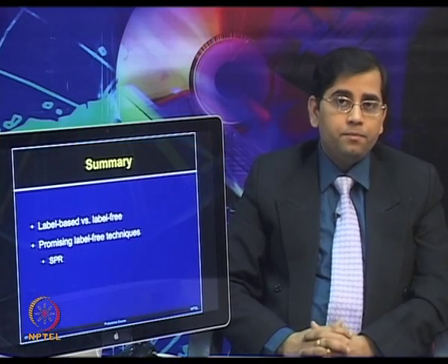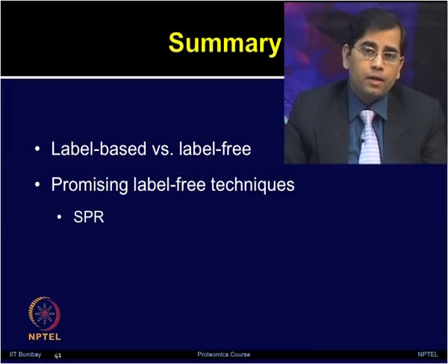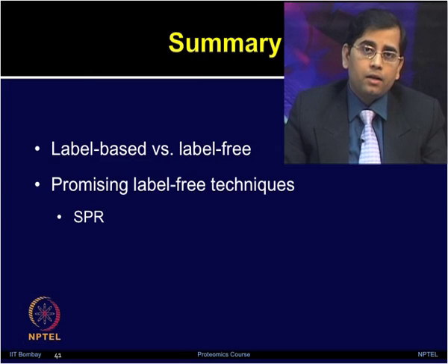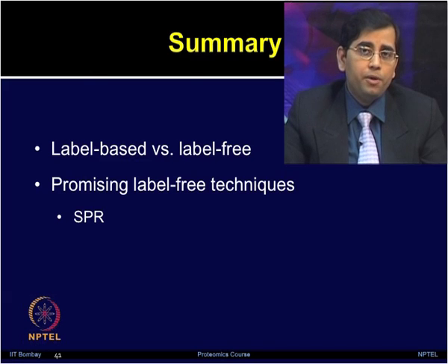So, in summary, in today's lecture we talked about label-free detection techniques which monitor biomolecular interactions and simplify the bioassays for various applications by eliminating the need for secondary reagents. Moreover, they provide quantitative information for the binding kinetics.